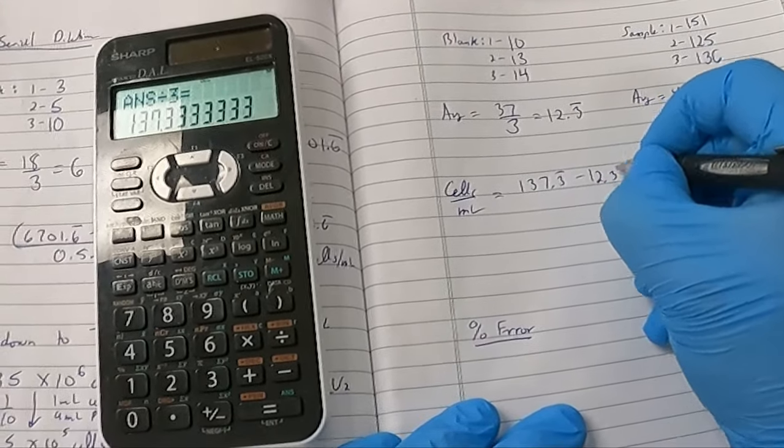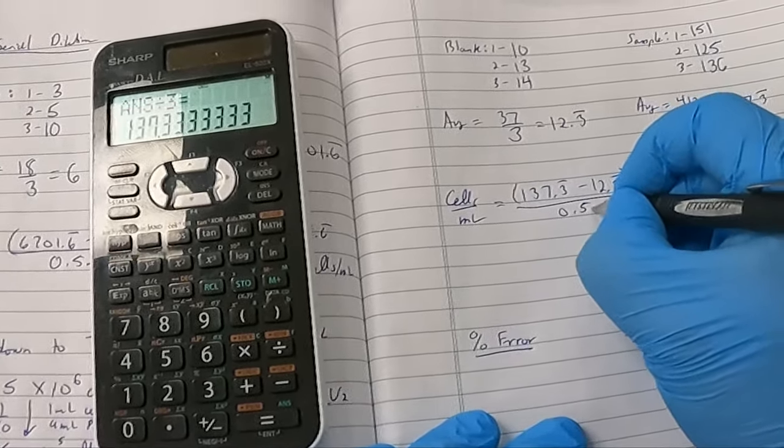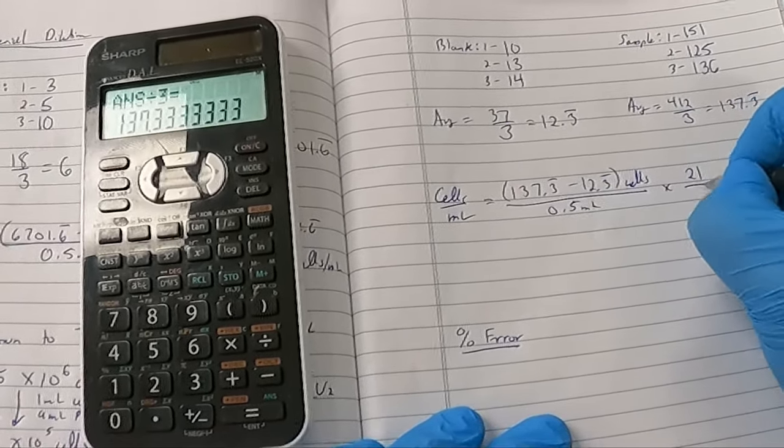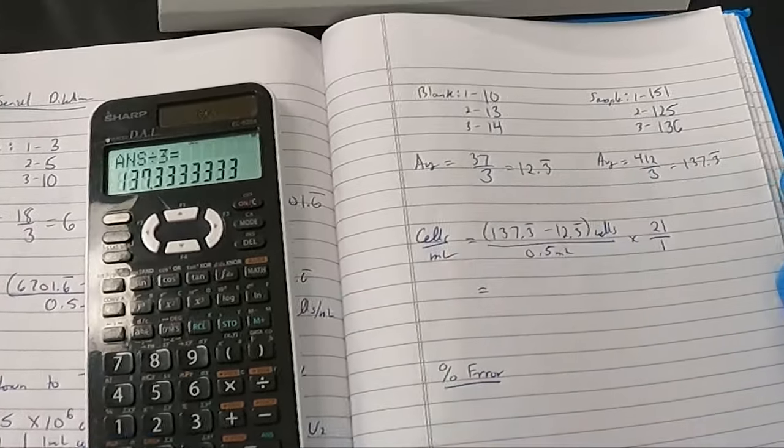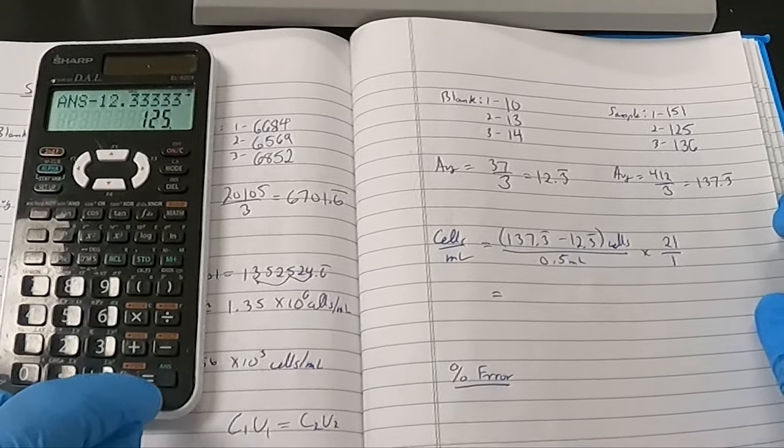Calculate the concentration. Average sample minus average blank. This represents number of cells. Divide by 0.5 mils, the volume drawn into the machine. And remember, dilution factor now is 21, because we loaded 1 mil of our sample in.